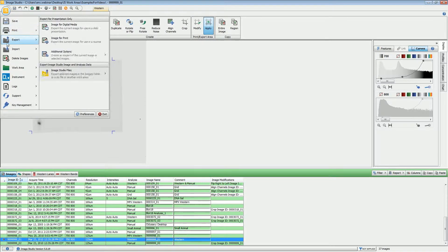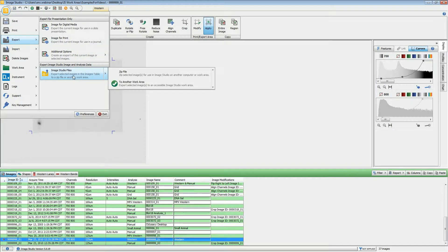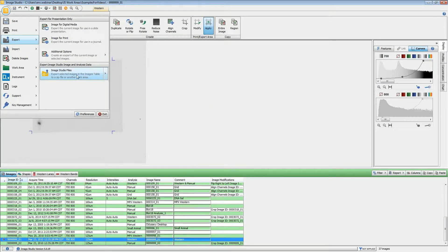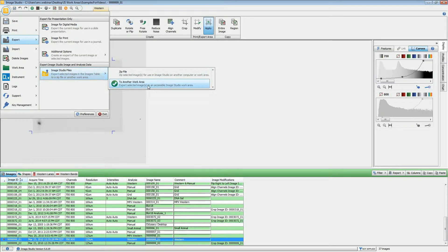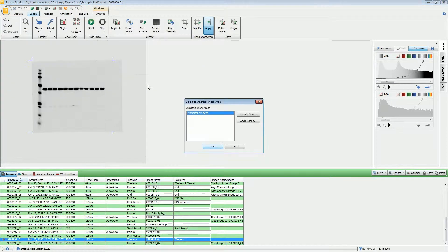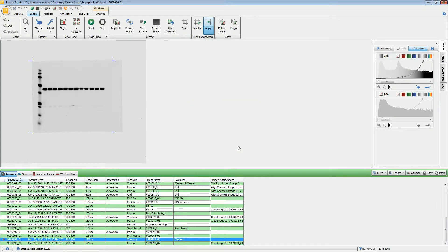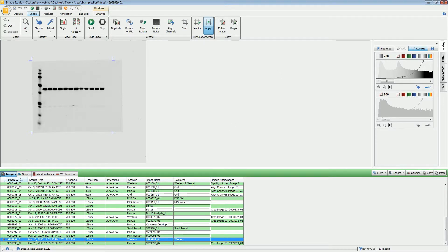You also have the option of moving the images to a different work area. So if you're on the same computer but you simply want to move the images to another work area, again you highlight the images that you wish to move and choose To Another Work Area. Choose the work area that you wish to move them to, click OK, and those files will be copied to that new work area.